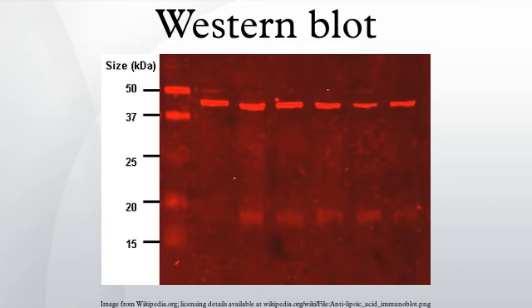Given the advent of high-throughput protein analysis and lower limits of detection, however, there has been interest in developing one-step probing systems that would allow the process to occur faster and with fewer consumables. This requires a probe antibody which both recognizes the protein of interest and contains a detectable label, probes which are often available for known protein tags.